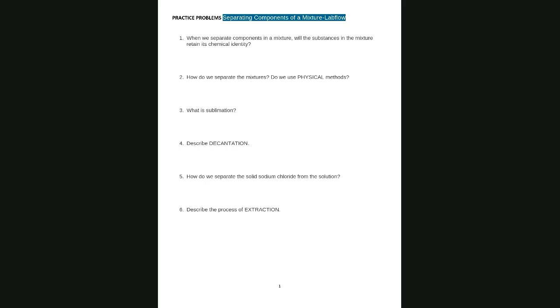So you gently pour. Remember that picture that we have: you have a beaker here, and then we have another beaker here that has the solid on the bottom, and the rest is all liquid.